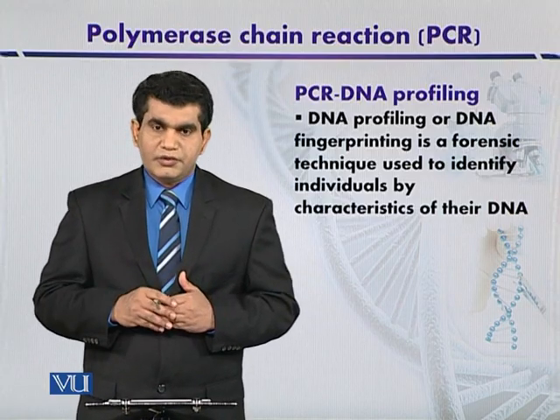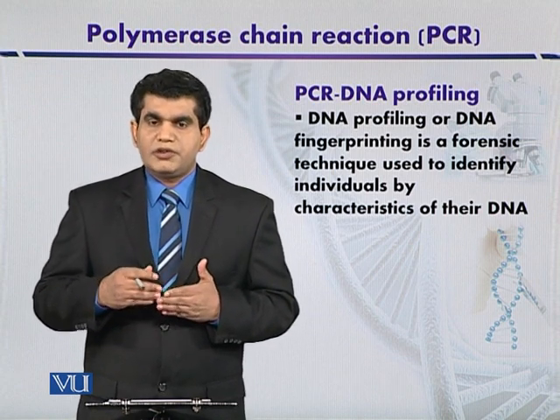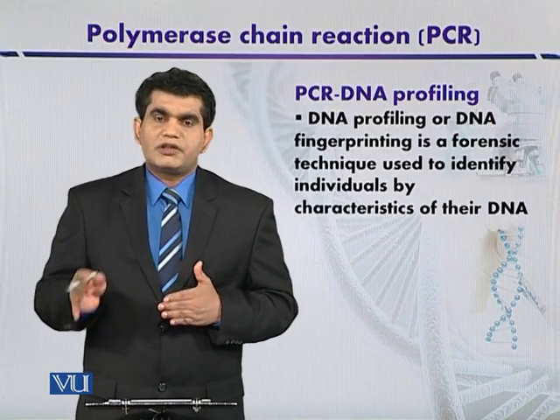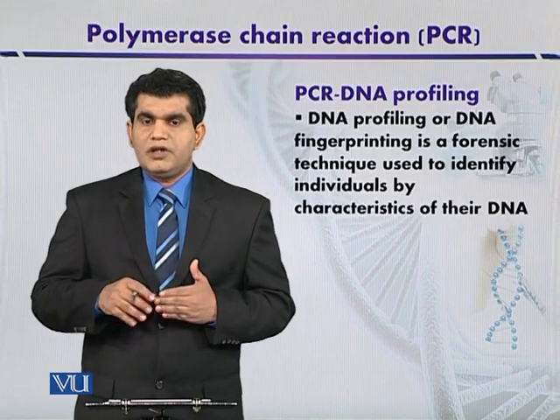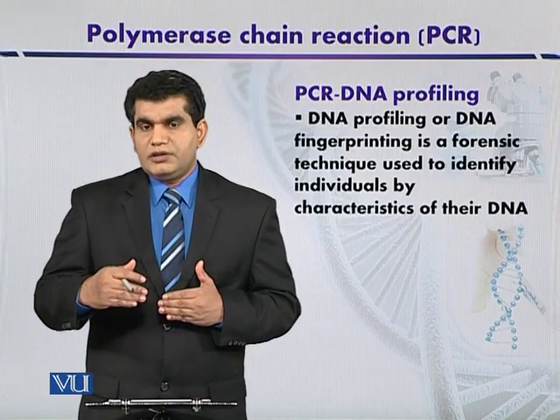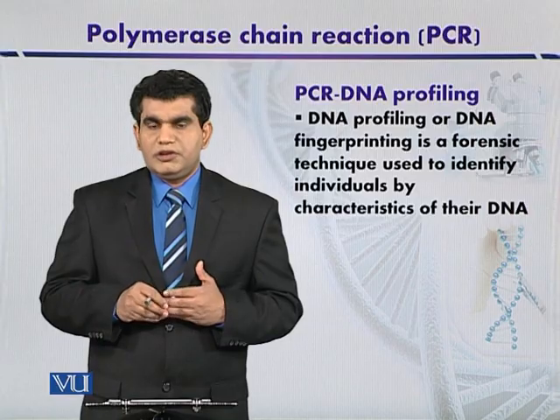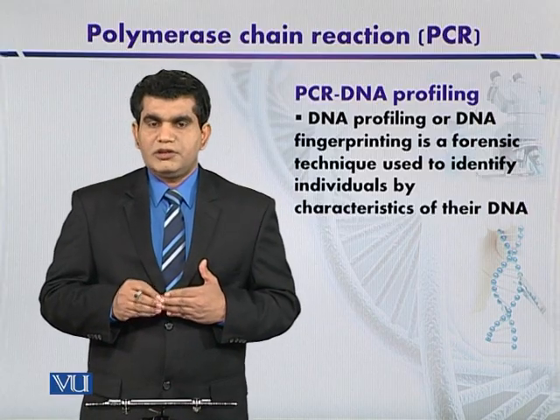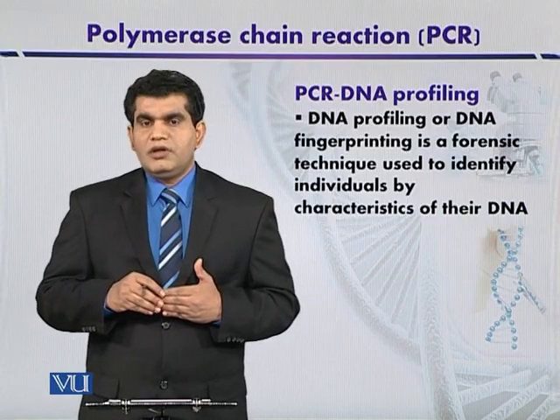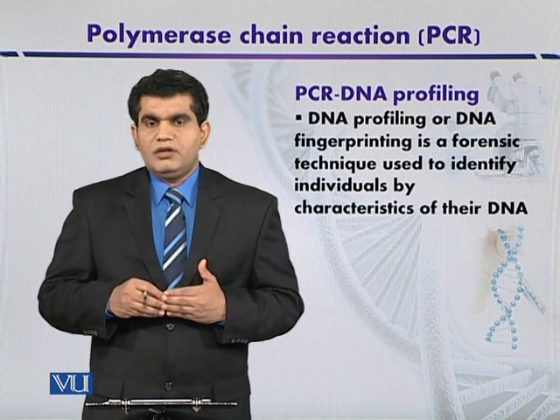So we have to apply a combination of procedures: the extraction process must be there, then separation on the gel, then transfer to the nylon membrane, then we have to perform autoradiography to detect the DNA fragments. Although this technique may be a bit time consuming or laborious, it is effective in order to get the profiling of the human genome. So this is one of the applications in forensic sciences.